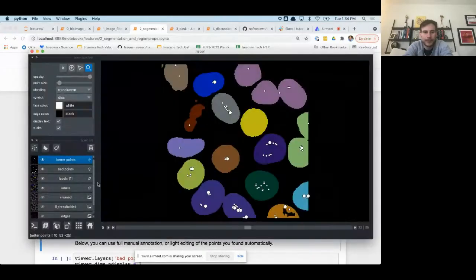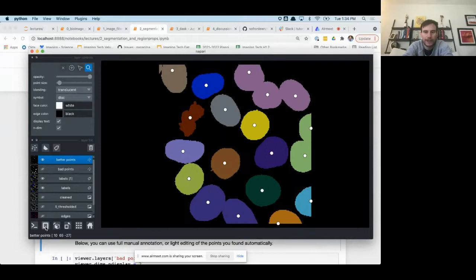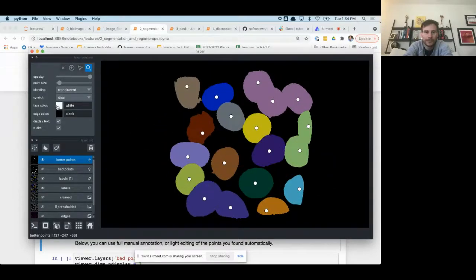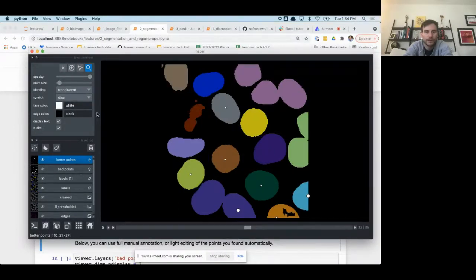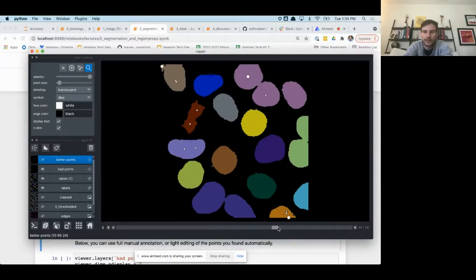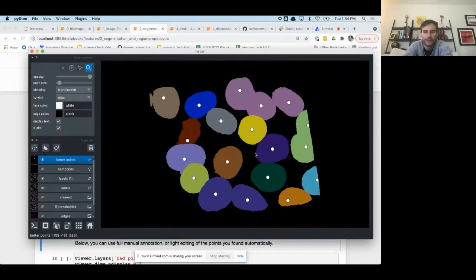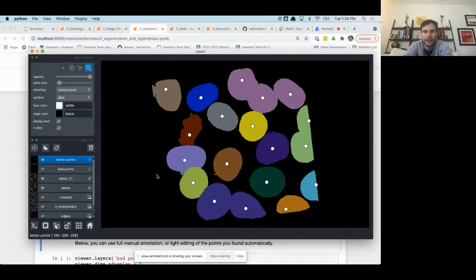and let's go over to Napari and see what has happened. I maybe should have made these points a different color, but it's okay. So if I look now in 3D, you can see how this is much better. Maybe I'll just leave it like this actually. And so you can see how it's gotten much better for these points versus these ones.